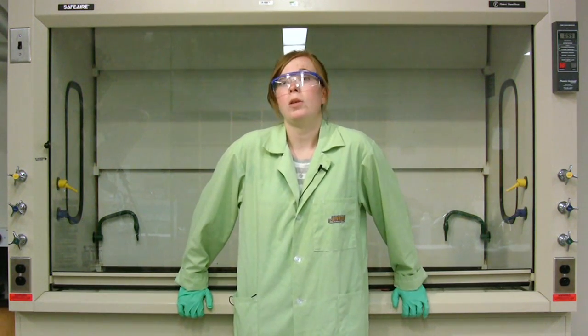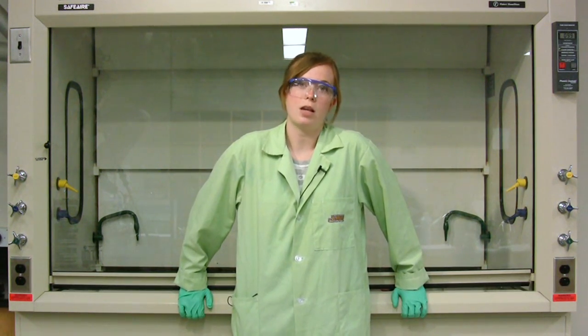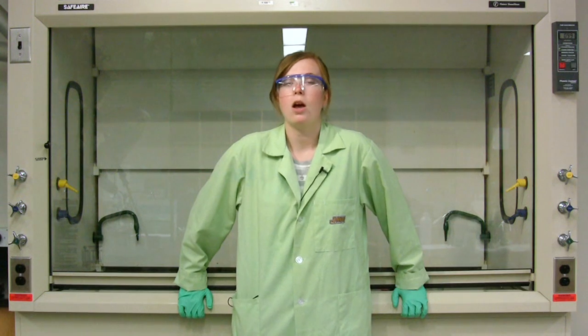Chromium salts are going to be used in this demonstration and they will be properly disposed of after this demonstration, because they are toxic to humans and the environment. Also, this demonstration should only be done in a fume hood.